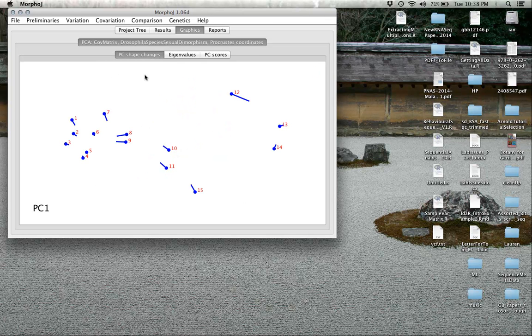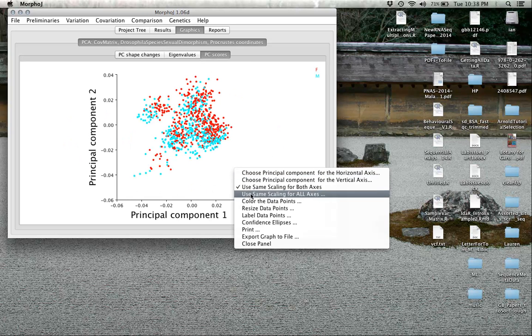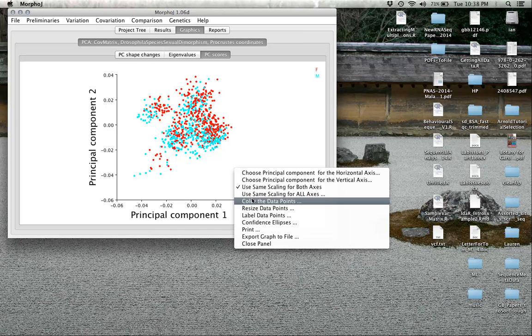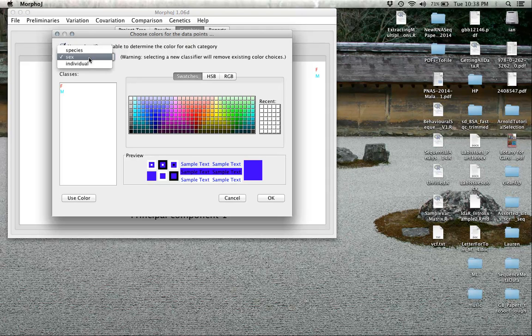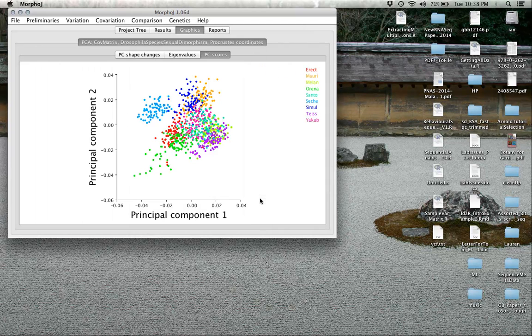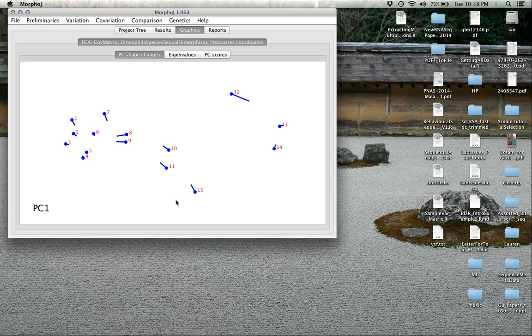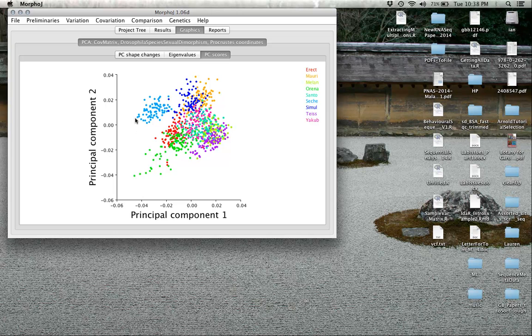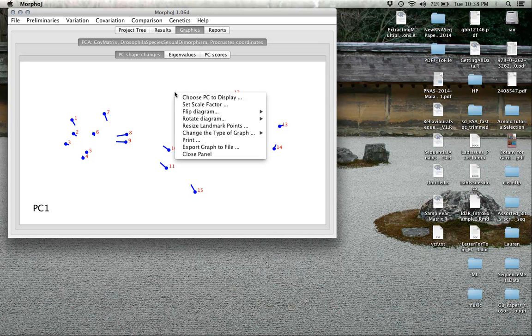Going back to this first plot, variation on principal component 1 here, let's recolor these data points by species since that was clearly one of the most dominant features. This is giving us a visualization of what it means to move from one side of that axis to the other. If you happen to be an observation over on this side of PC1 to this side, this is the shape change you're observing going from negative to positive values.